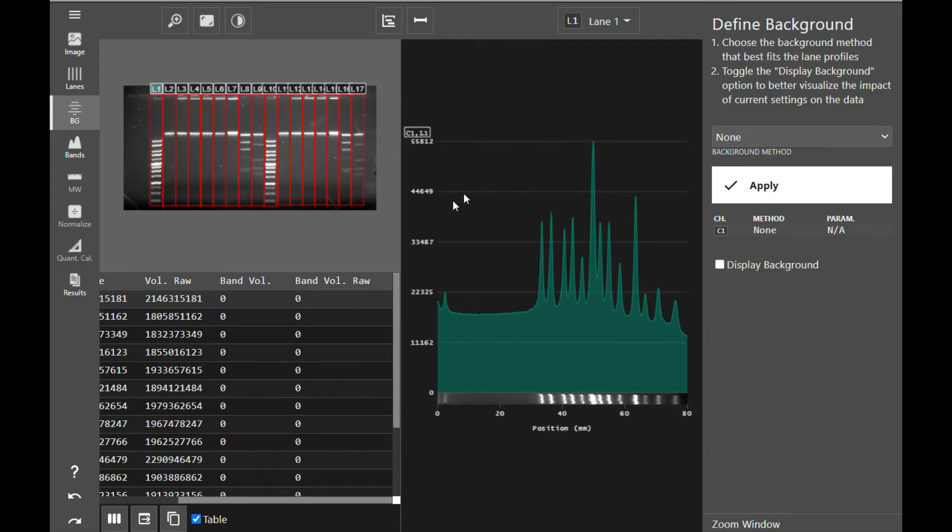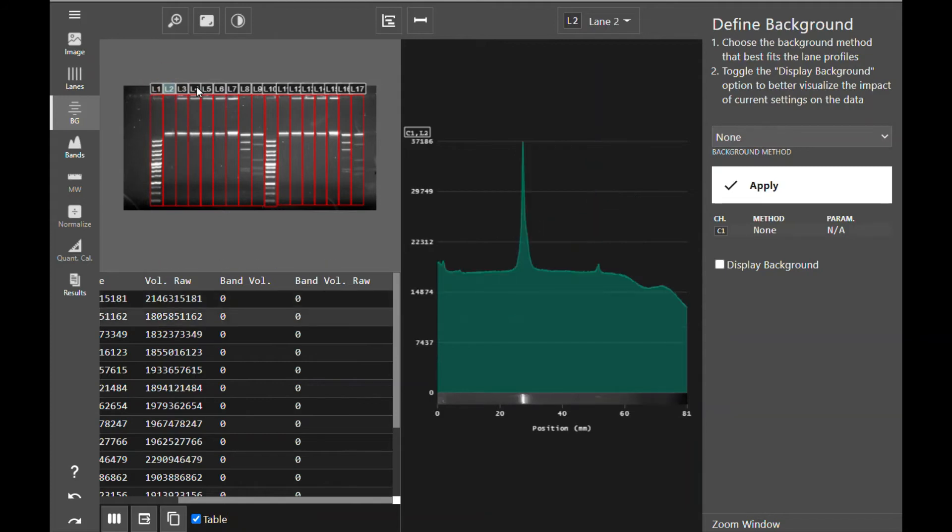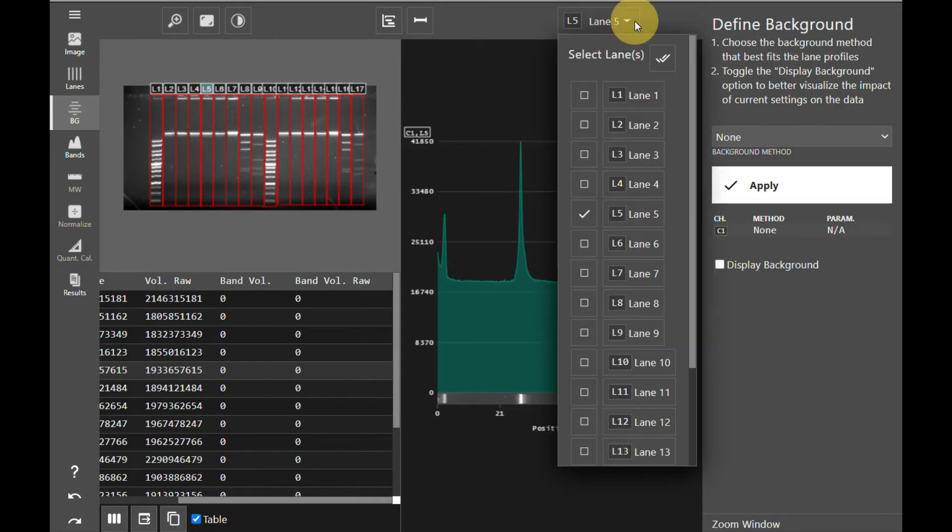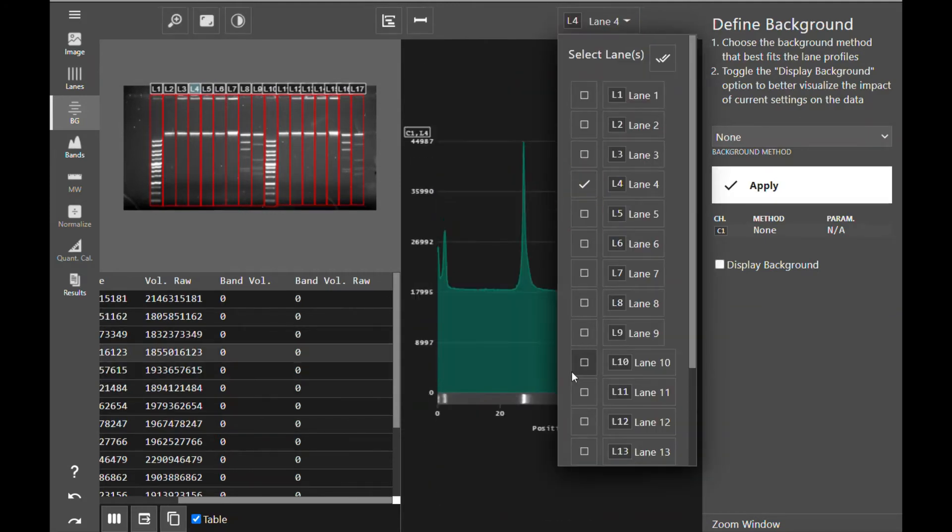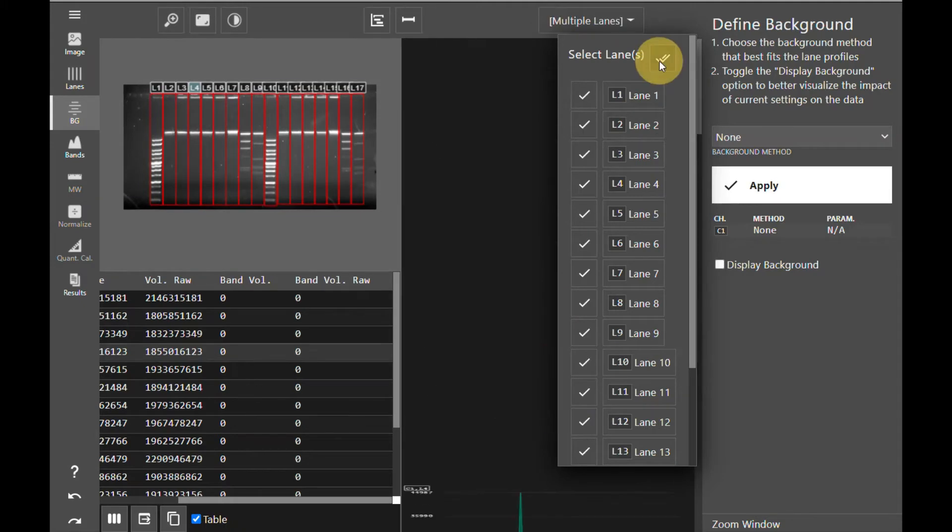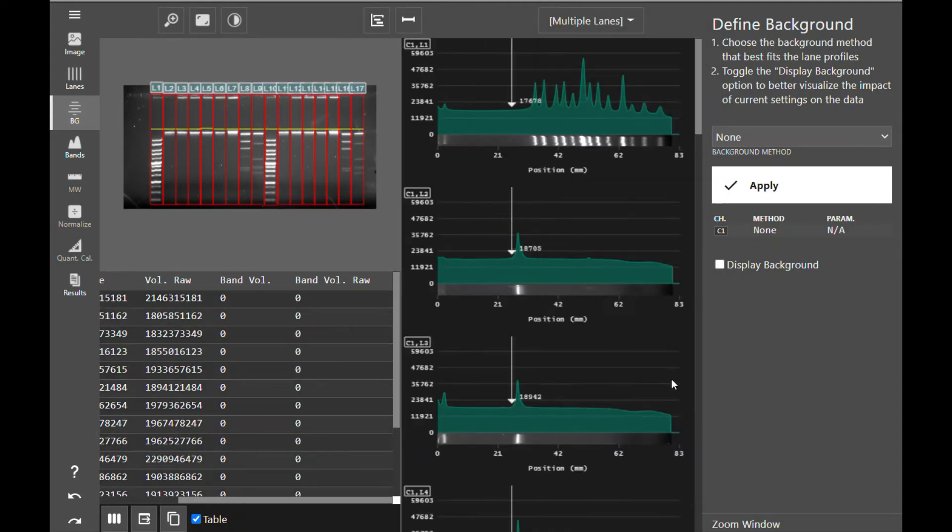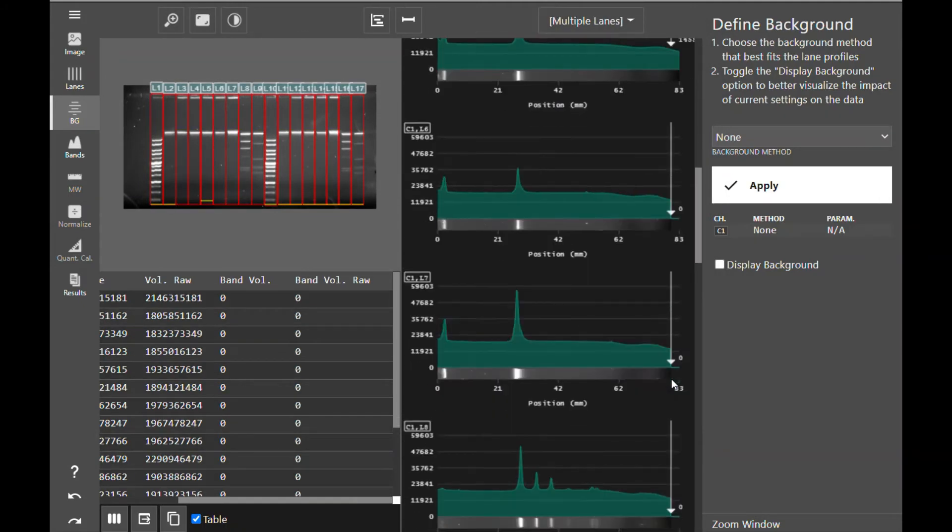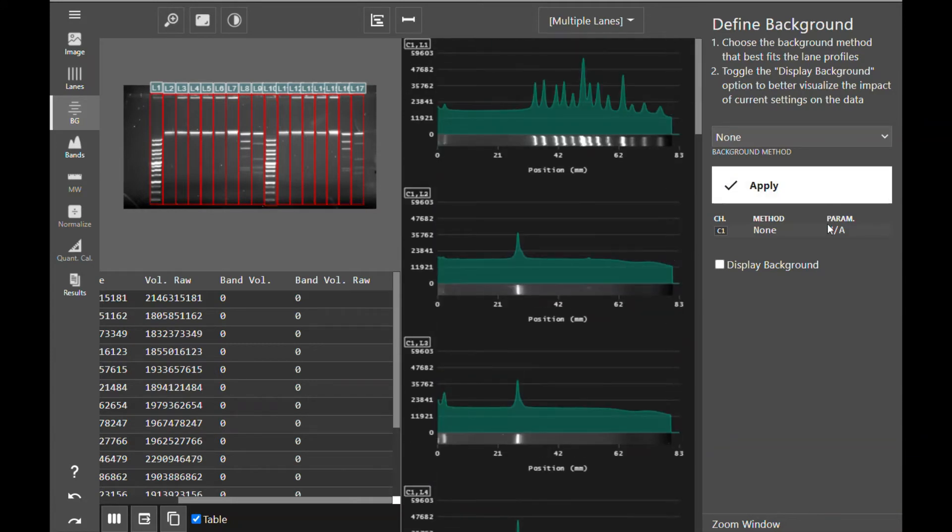On the right, we have the signal profile of each individual lane, which you can view by selecting your lane in the image or you can select lanes from the dropdown to view individual lanes or to view multiple lanes. As usual, the software will walk you through exactly what you need to do in each tool in order to analyze your image.